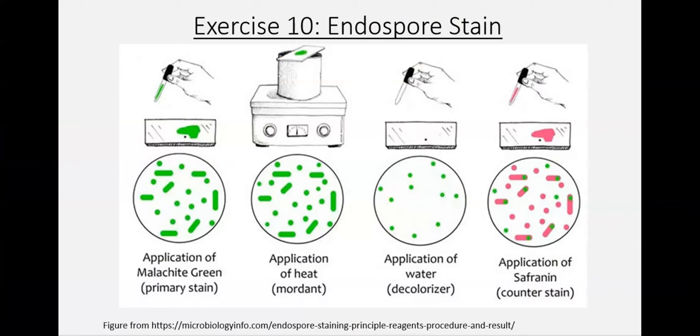In part two of this video we're going to take a look at the actual process of the endospore stain. We're going to be applying this malachite green stain that is our primary staining solution. Malachite green actually comes from malachite rocks that you might have seen in a rock or gem store and it's just ground up and it has this greenish color to it from the copper that's in there. We'll take this solution and apply some heat and that will help to drive the malachite green stain into the spore coating that is surrounding the spore.